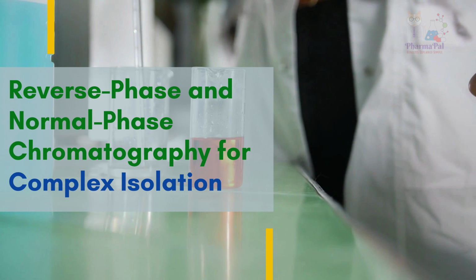Molecular weight and size: the molecular weights and sizes of the compounds can also play a role in separation techniques such as size exclusion chromatography. Understanding these properties can help in selecting the appropriate method for separation. Chromatography techniques: various chromatographic techniques can be employed based on the properties of the compounds. Techniques such as thin-layer chromatography, TLC, high-performance liquid chromatography, HPLC, or column chromatography may be suitable depending on the scale of the separation and the desired purity of the compounds.